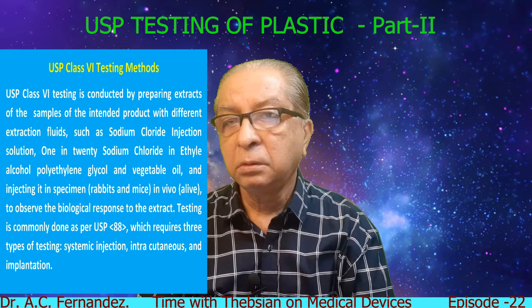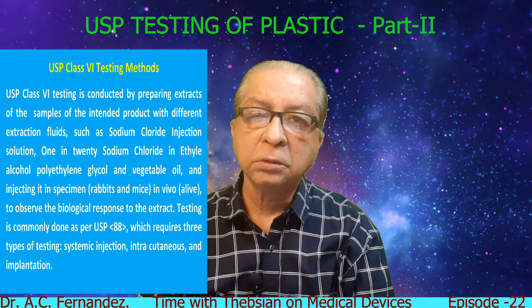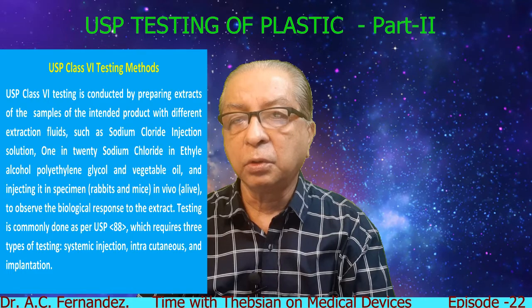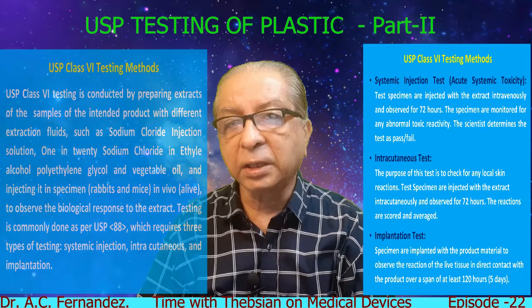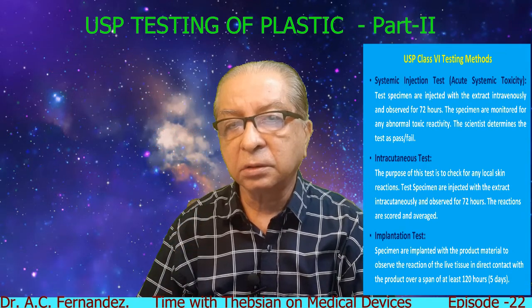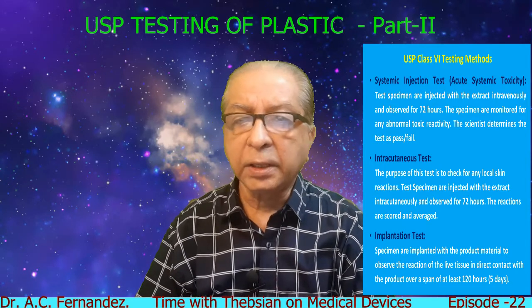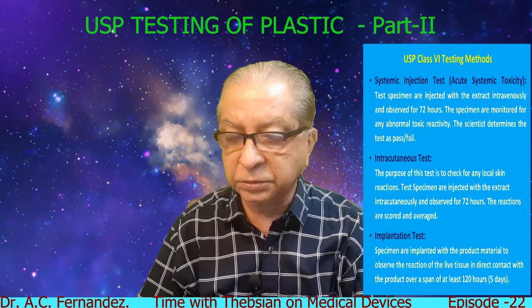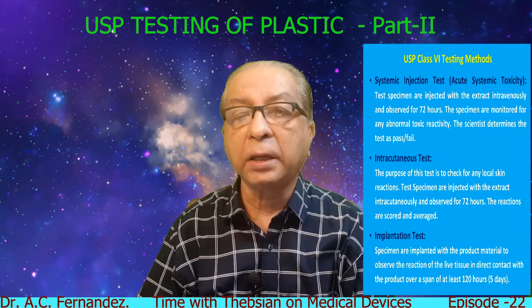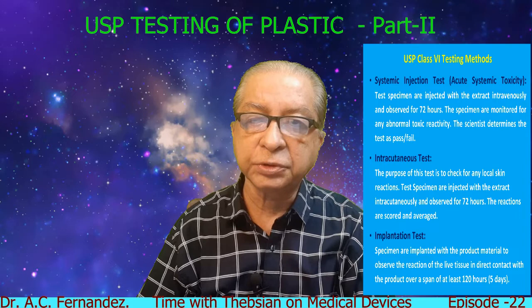But to make sure whatever plastic is used by a manufacturer, they have to undergo testing using USP standards. So, the general conditions and tests that are described in the United States Pharmacopoeia for plastic. In USP tests, there are 6 classes, and these are used to certify that there are no harmful reactions or long-term bodily effects from various plastics or materials used as containers.